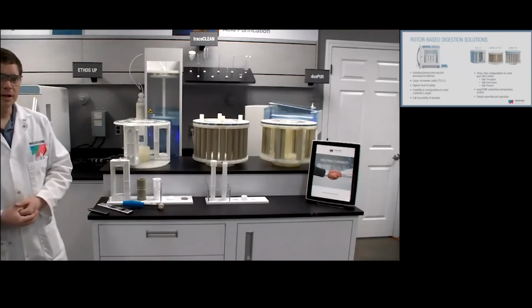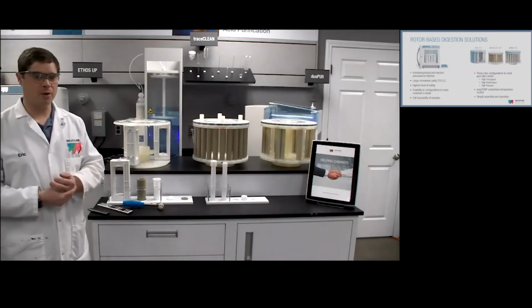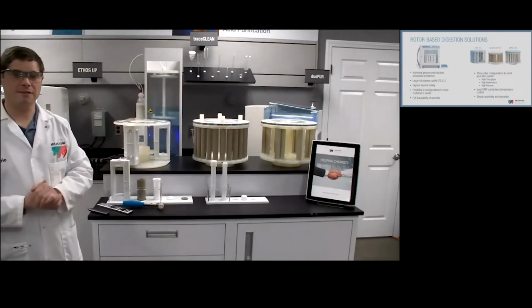However, on occasion, if you do have a sample that's a bit more difficult, say a fish oil or something of higher organics that may be just too difficult on the Maxi 44, then you may want to have a few segments of the SK15.